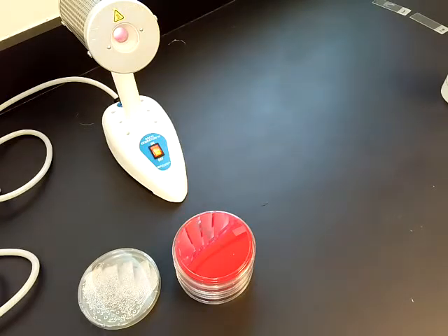In this video, I'm going to discuss selective and differential media. Typically when we get a culture that's sent down to the hospital from a patient, we need to be able to differentiate or distinguish between the microorganism that's actually causing the infection versus the normal microorganisms that just live in the body, and even compared to normal contaminants that you might find in those types of samples. So there is selective and differential media that allows us to get a diagnosis a little bit faster.